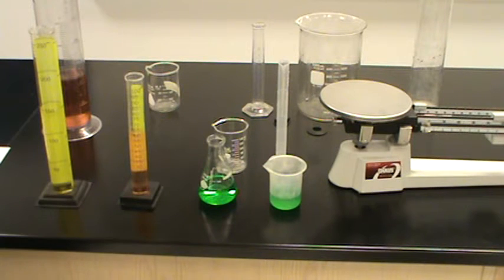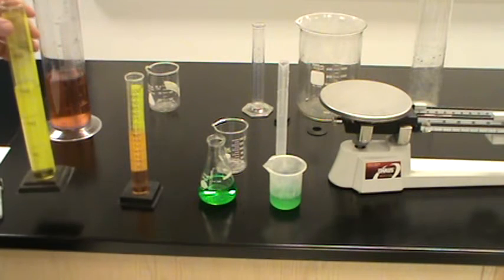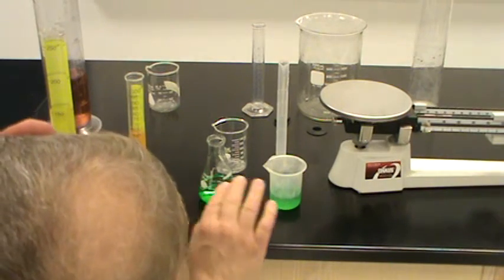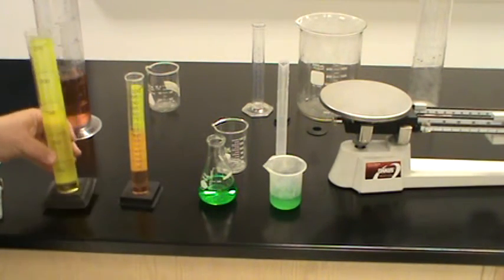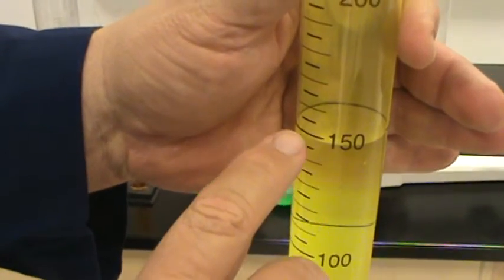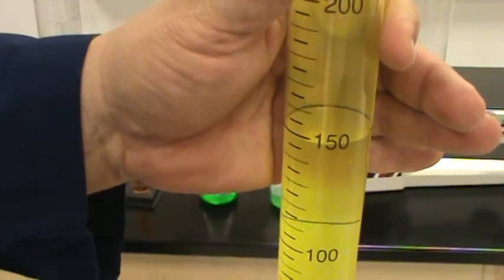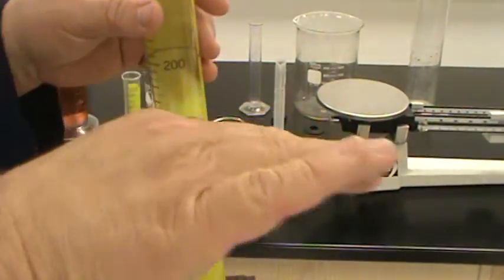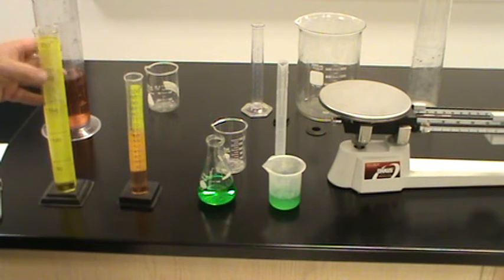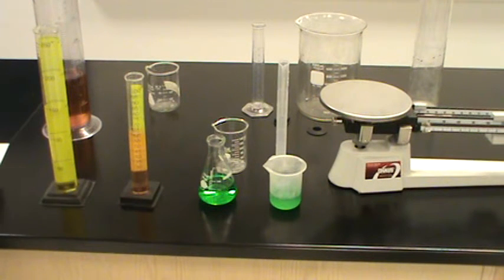I then asked you to please tell me how much was in each container. And to do that, we had to get down and, pardon my bald head, get even with it so that you can see across as to how much is in it. But I'll bring this one up here so we can take a look. And so I'm going to put my hand back here, and you can see that the water comes to the 150 milliliter line. And because the camera's at an angle, looking down, it's very difficult to see that. But that's all right. It's 150 milliliters in this container.